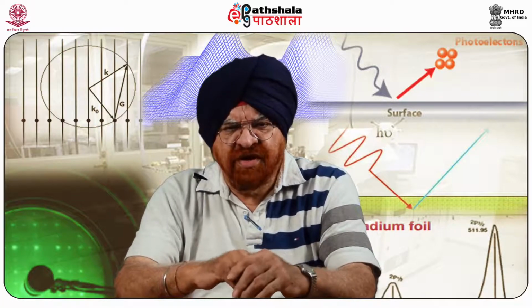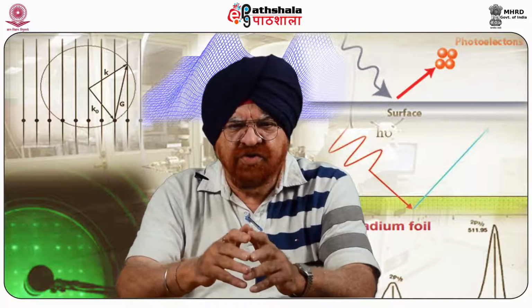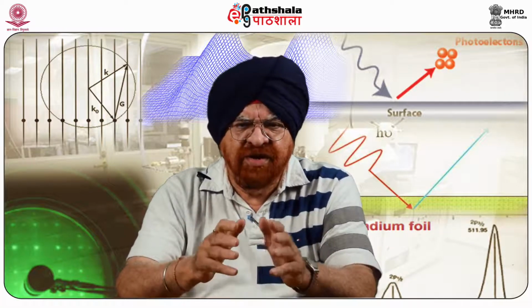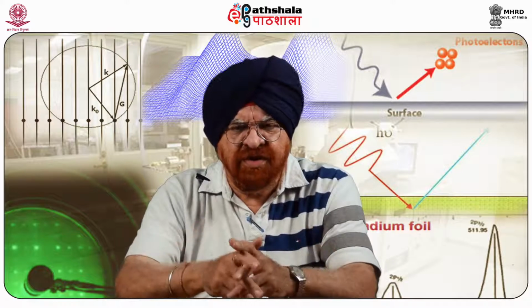XPS, as I've said earlier, is a surface chemical analysis technique that can be used to analyze the surface chemistry of a material in its as-received state or after some treatment.